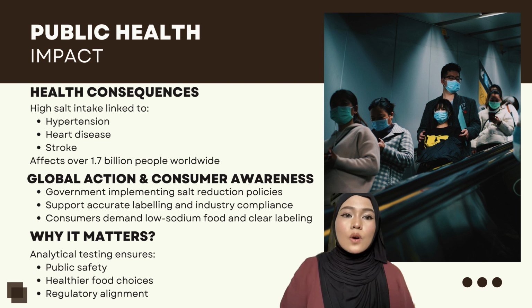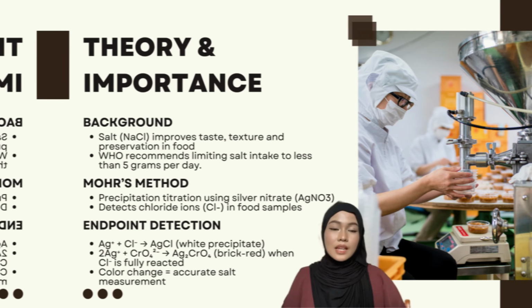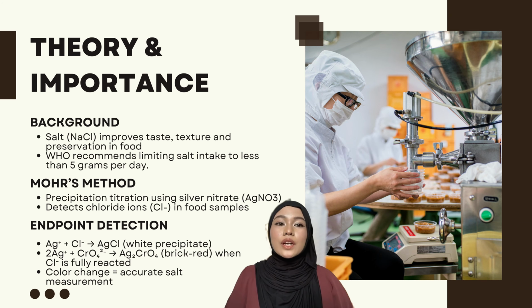And the last one is, why does it matter? Analytical methods like Mohr's titration help ensure that food products meet regulatory standards and support the goal of producing safer, healthier food. These tools play a key role in promoting public health and informed consumer choices. Next, I will be presenting the theory behind salt content analysis and its importance.